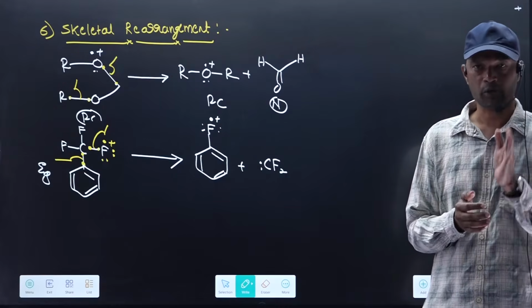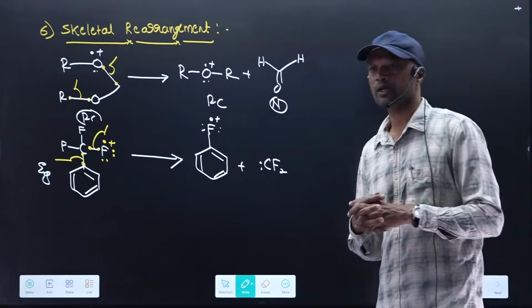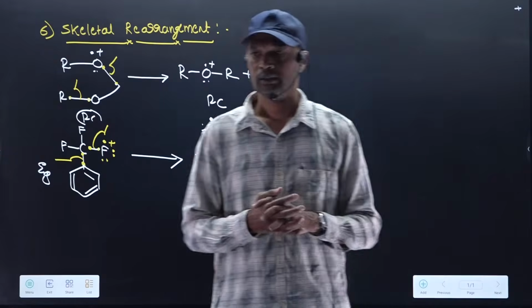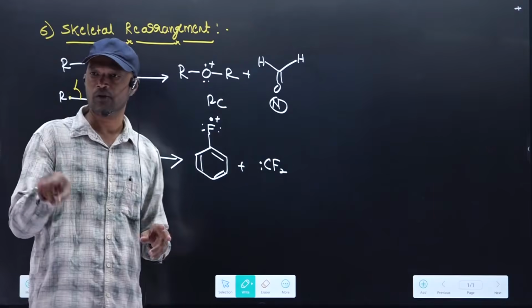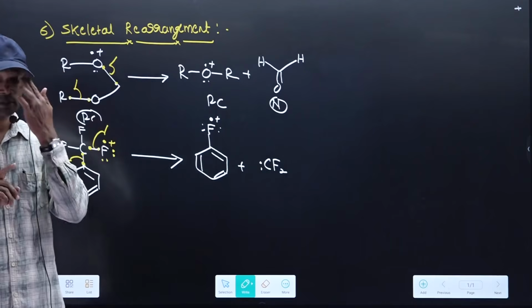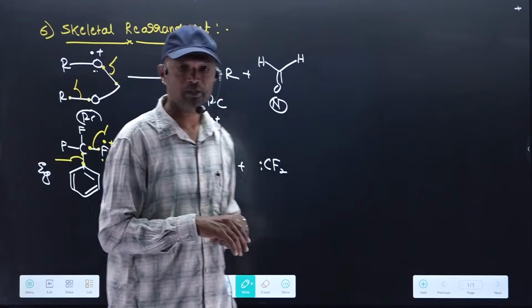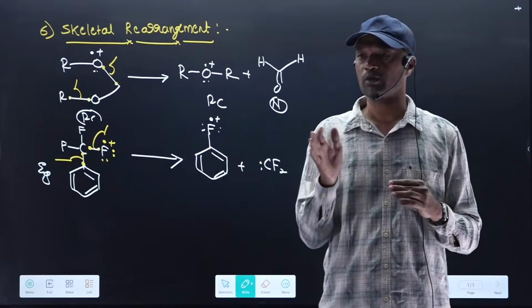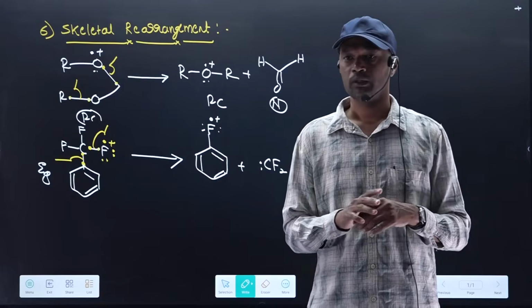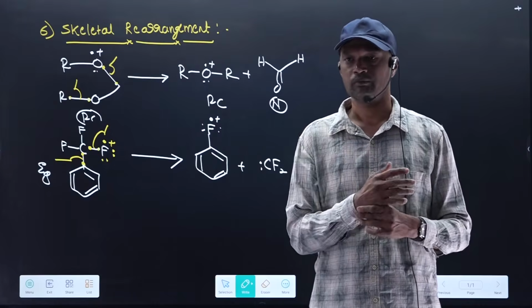Starting from what we started? Mass spectral fragmentation rules. First we learned for alkane. What is the characteristic fission for alkane? Straight chain: loss of successive CH2, alpha heterolysis. Branched chain: loss of the branched carbon having the maximum number of carbons in the form of a radical. So alkanes can be identified by a difference of 14 units between two adjacent peaks.